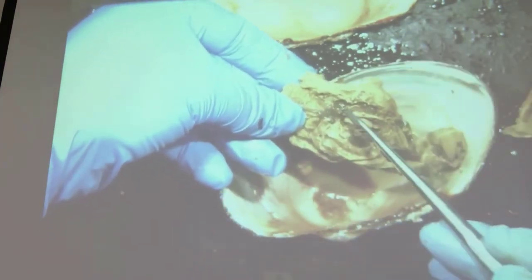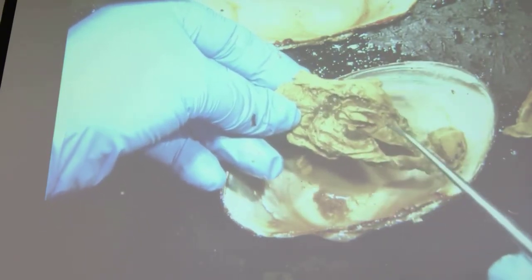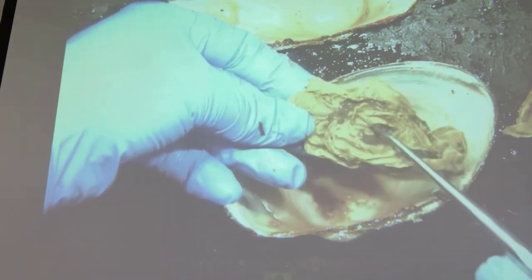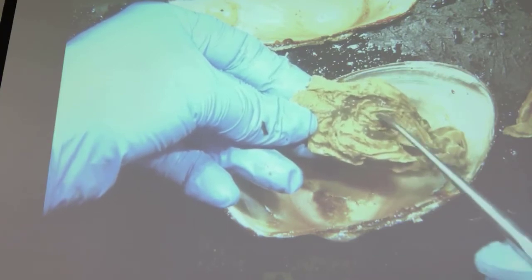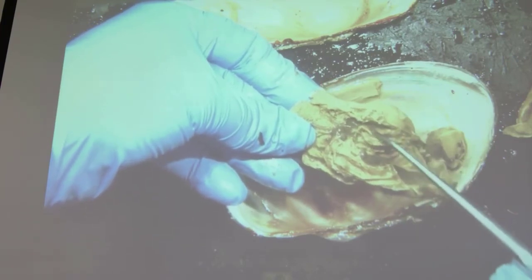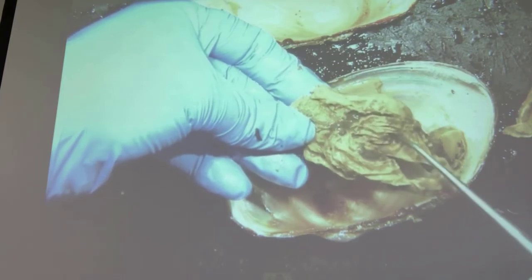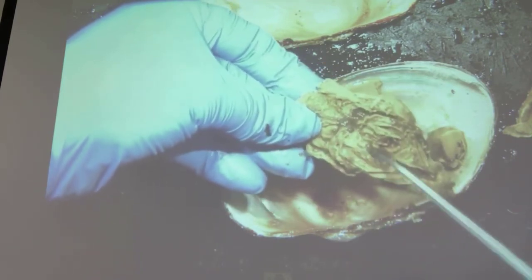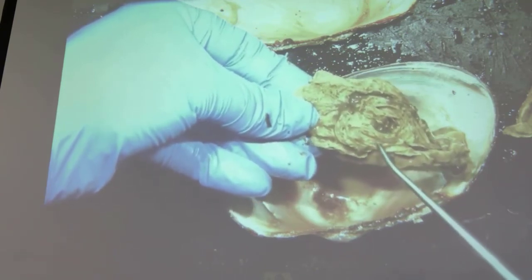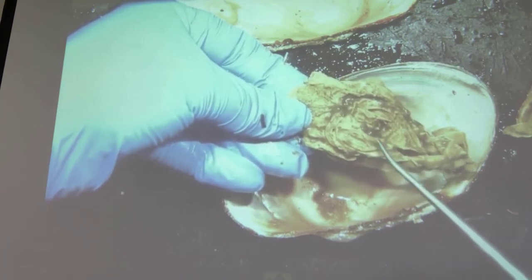so in here we can see the digestive gland, which will release enzymes to the intestine. The intestine is a coiled tube that will lie in the grooves that you can see here. It's very difficult to sometimes find the intestine. It usually ends up getting cut with the dissection. There's a little bit of it right here. That's the intestinal tube right there.